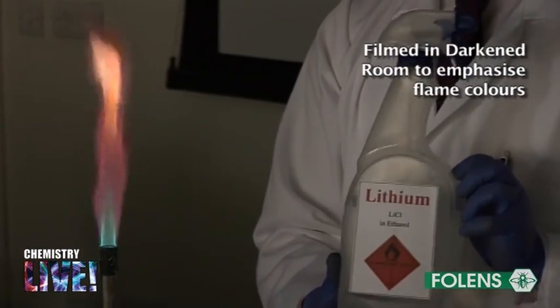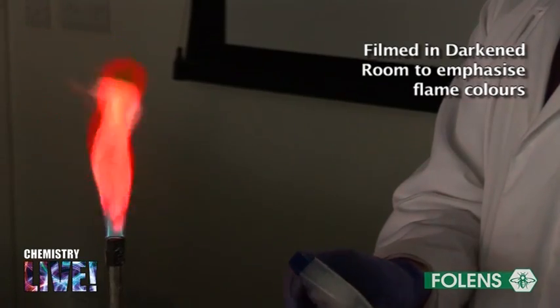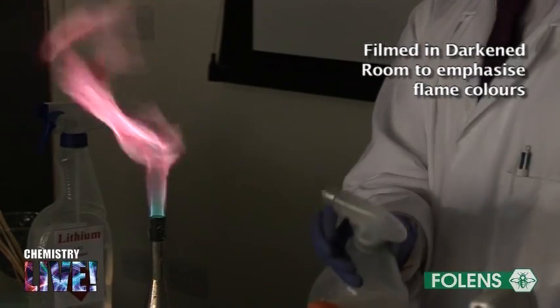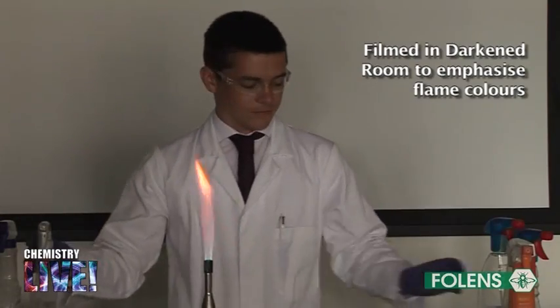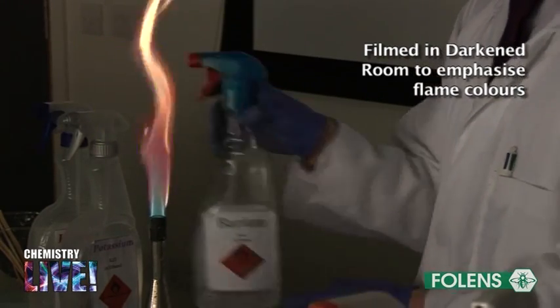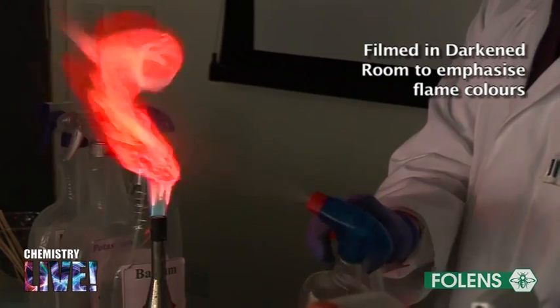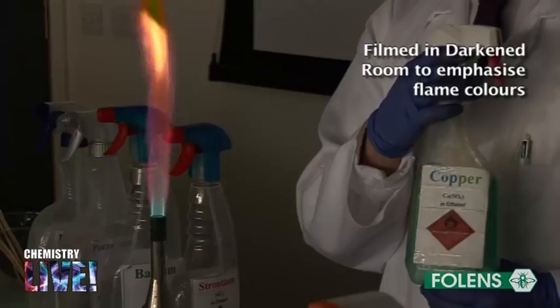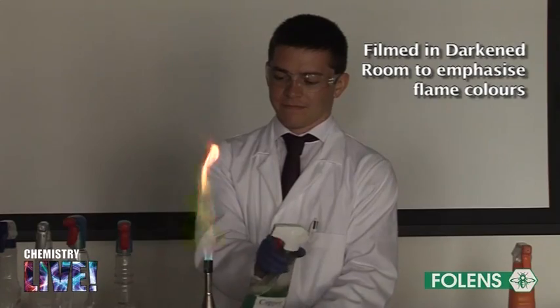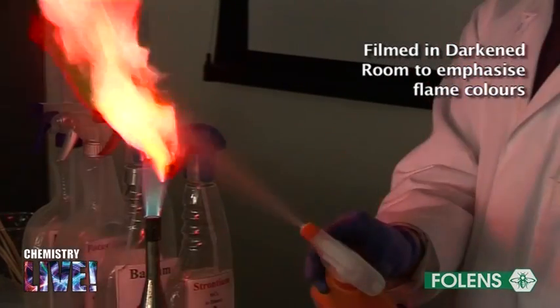Lithium gives a crimson color. Potassium gives a lilac color. Barium gives a green color. Strontium gives a red color. Copper gives a blue-green color. Sodium gives a yellow color.